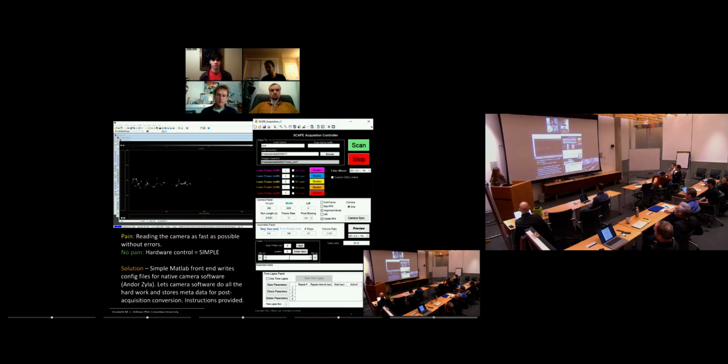But Richard also came along, and he wanted to augment the system, and he very easily was able to edit this with, I'm not going to say basic MATLAB knowledge, but he can change the front end, he can change the back end. With all the systems in the lab, we have about 8 different systems, and to be fair, each one is tweaked slightly, but then we have a core version. That is the one that we're disseminating, and then providing updates to.